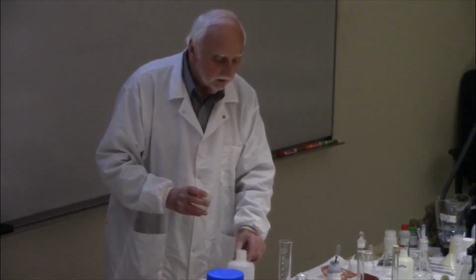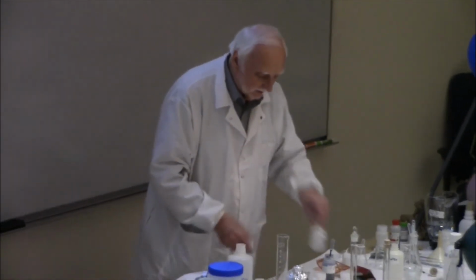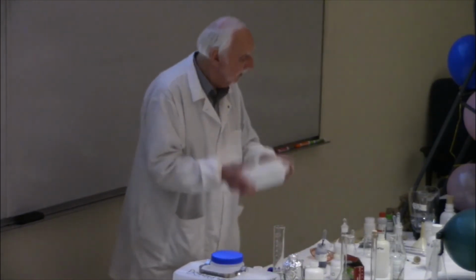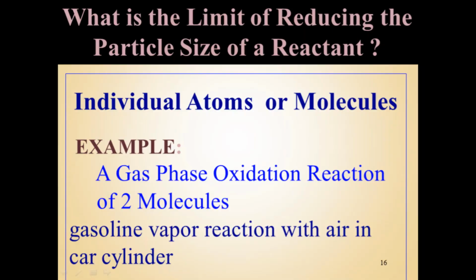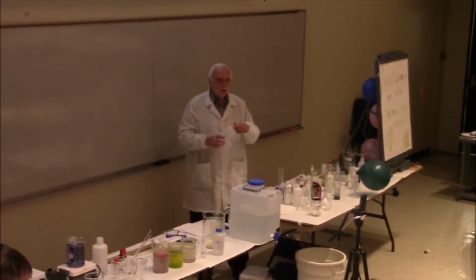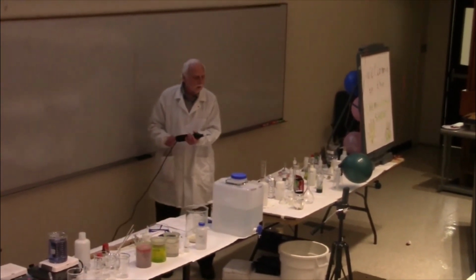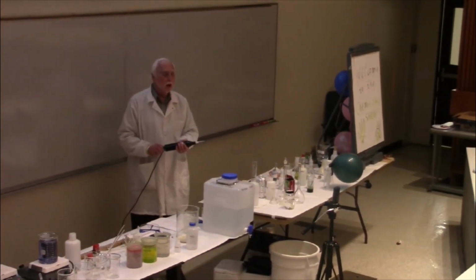So I'm going to pour some liquid methanol in. But of course, if I put a spark across there now, I'd be blown to bits because we have vapor and liquid. So what we're going to do is shake it up, fill up this bottle with the vapor. Now it's a bottle that's filled with methanol vapor and air, but the critical reaction is methanol and oxygen. And I have a Tesla coil, I'm going to put a spark across it and we'll see what happens. Again, we're at the limit of particle size with molecules.